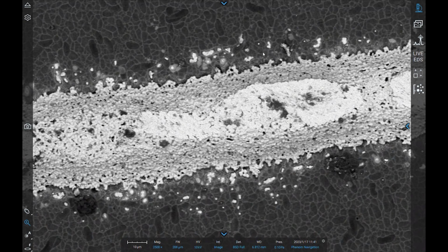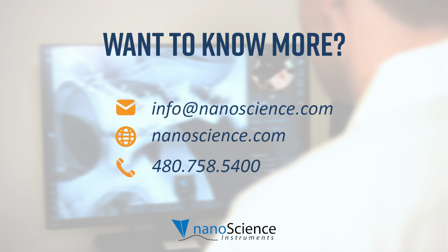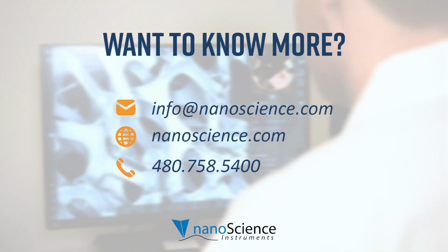I hope this video was helpful in understanding the different ways to navigate your samples in a Phenom SEM.